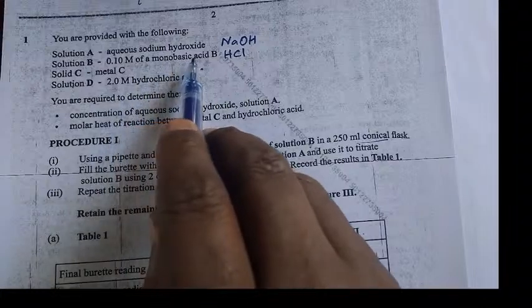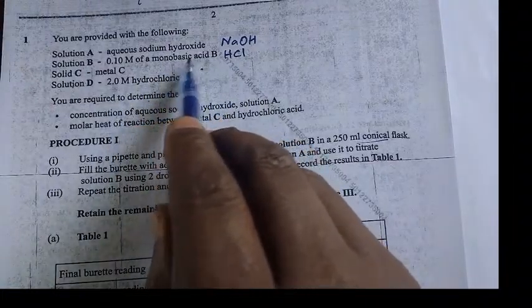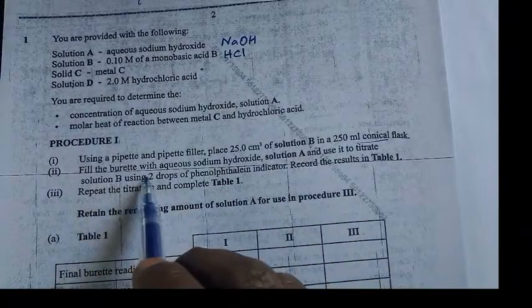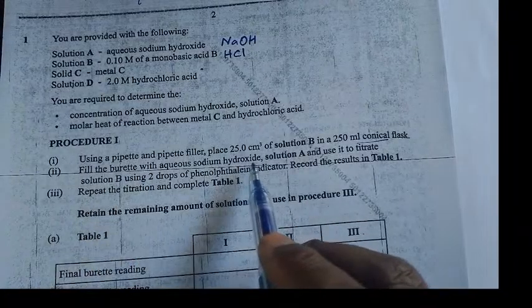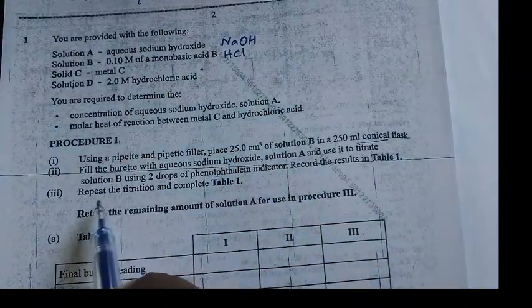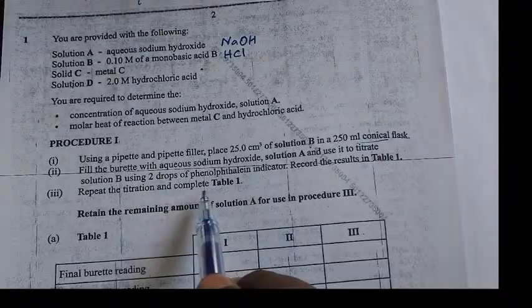It is from a monobasic acid, which is monobasic acid B. Fill the burette with aqueous sodium hydroxide. So for sodium hydroxide and the acid, the mole ratio is... We repeat the titration and complete the table.